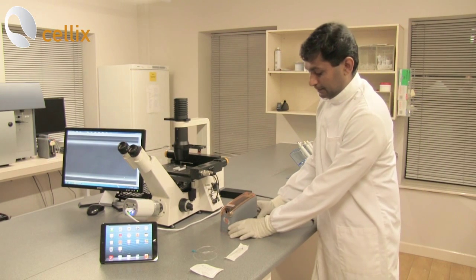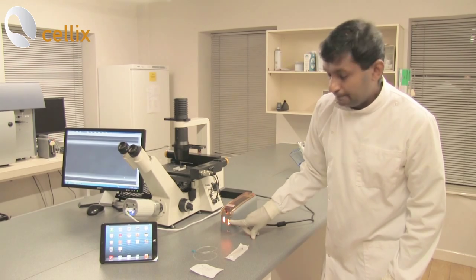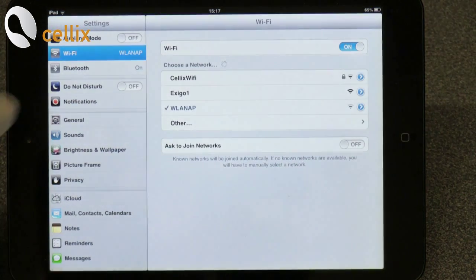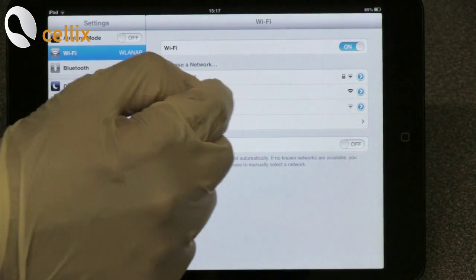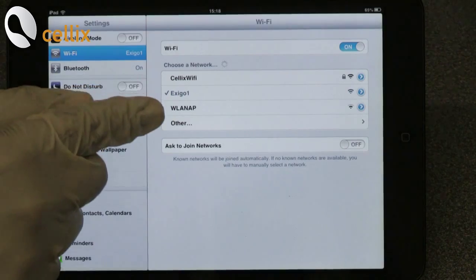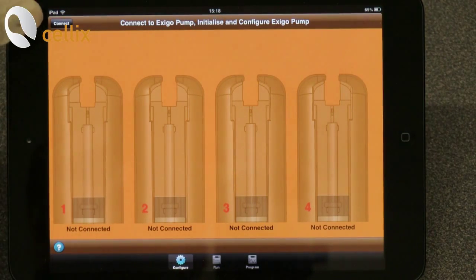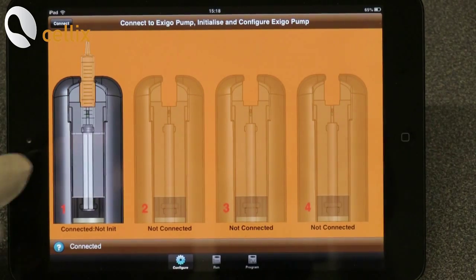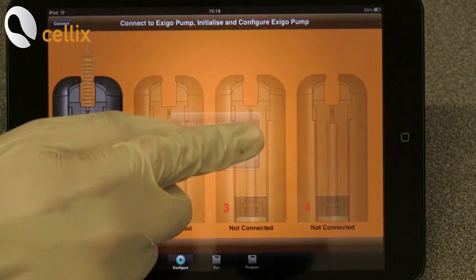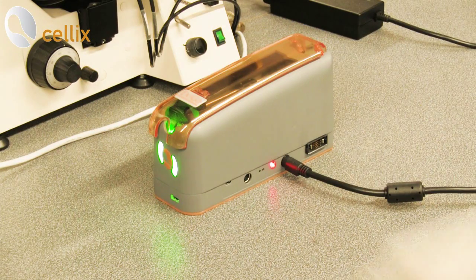We are going to switch on the pump. Since there is no flow sensor connected, the light is in orange. Now we want to connect to the Wi-Fi network of the ExiGo pump. For that you go to Settings, go to Wi-Fi and click ExiGo one. Now it's connected. Next we need to start the app by clicking connect, then double click the plunger — it asks to initialize the pump. Click initialize. Now the pump is initialized and you can see the green color.